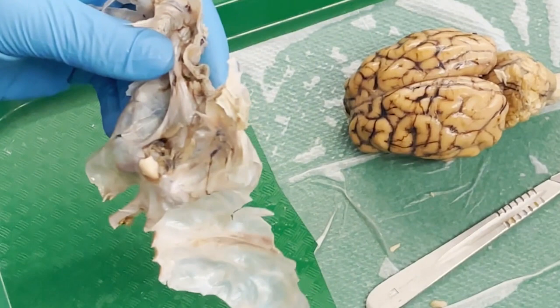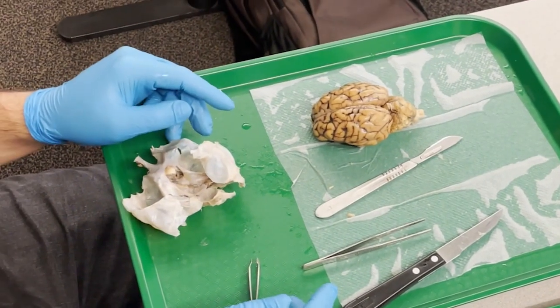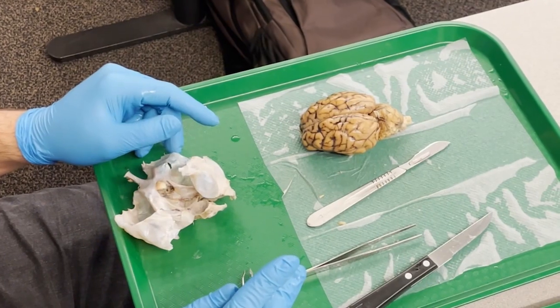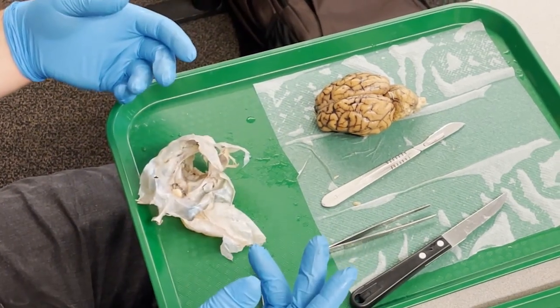I mentioned briefly in the neuroanatomy lecture segment earlier on in the course that there were a ton of cranial nerves. You didn't have to memorize them. We don't have to worry about most of them in this class either, but I thought I'd point out where they may be. They're a lot easier to see when the dura is on. Once you take it off, you're pulling off the cranial nerves with it.